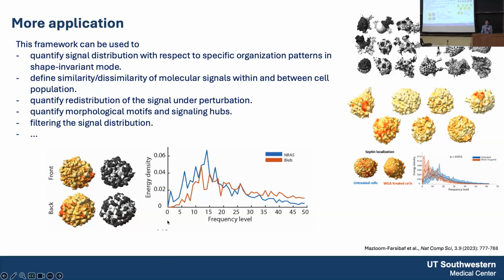So this profile shifted from low frequency to higher frequency. To address your question, if between time 1 and time 2 there is no significant difference in the spatial scale, we cannot capture that. But if there is a significant change, we can easily capture it.